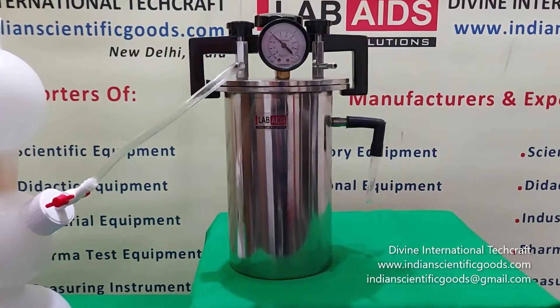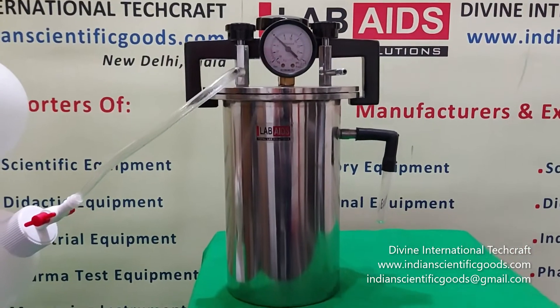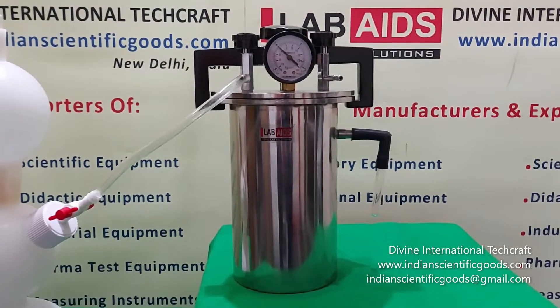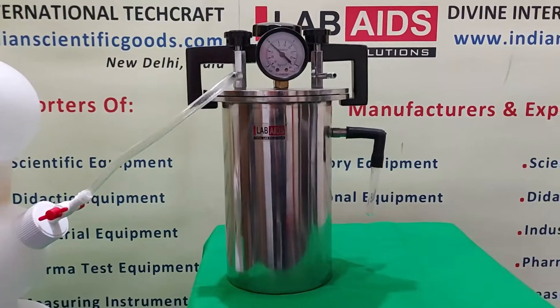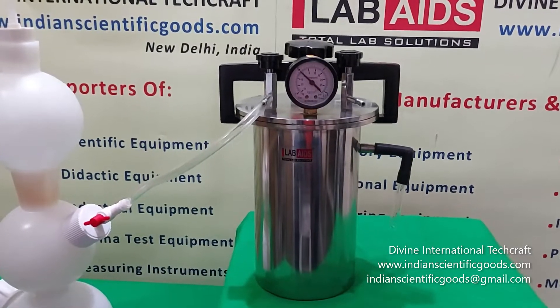It is a modification of the Macintosh and Fildes pattern. This is a simple but effective apparatus for creating anaerobic conditions. The jar, the lid, and the valves are made of stainless steel to avoid corrosion.